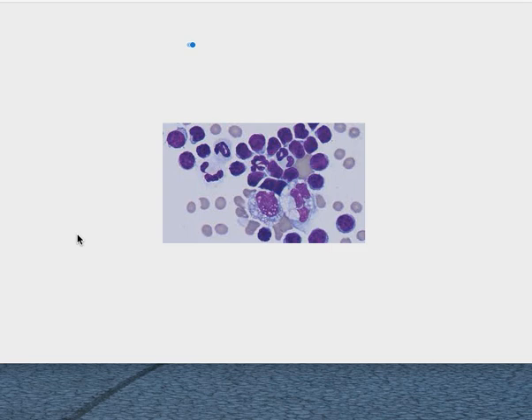So you guys really do know how to identify cells on this cytology. Some of them can look very different because they're in fluid that is not in a happy place. So the biggest deal we want this week is for you to be able to tell the difference between an inflammatory effusion and an effusion that may be coming from a neoplasia. So what are the cells of inflammation? It's really important that you know this, and you already do.